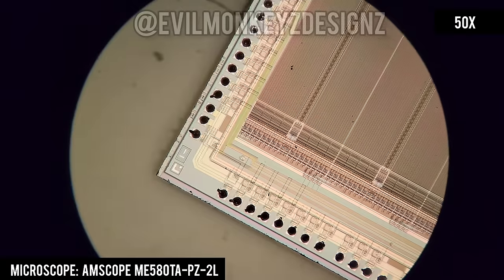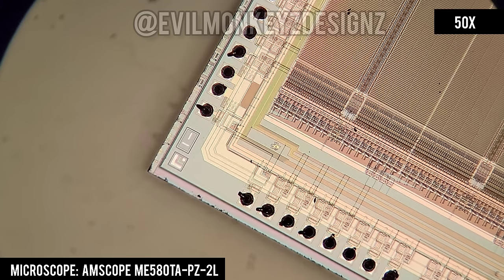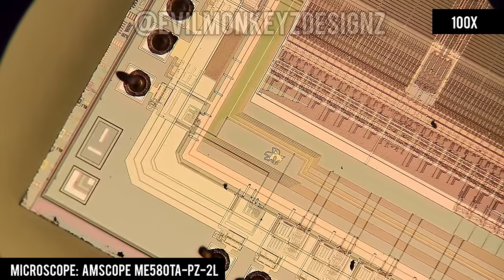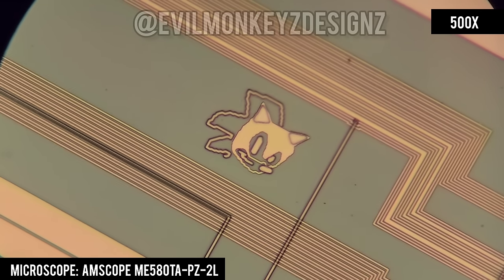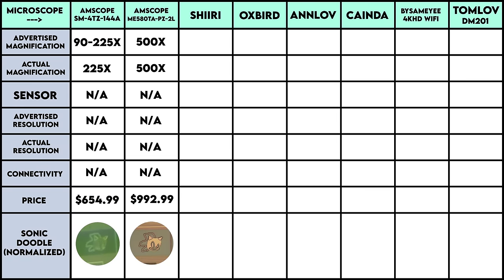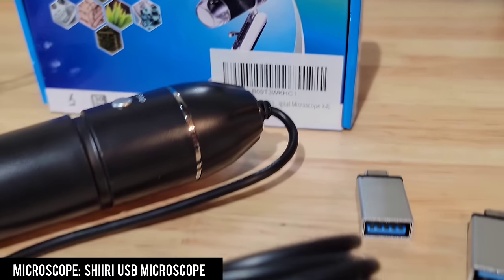Next let's take a look at Sonic. The ADS-P2181 is one of many DSPs from Analog Devices, many of which also have other Sonic-themed doodles on them. It's easy to pick out Sonic at 100 times magnification and even easier at 200 times. At 500 times magnification you can pick out all the details on Sonic and even see that he's on two different layers. At 1000 times magnification and beyond I'd expect Sonic to take up the entire screen. The price listed for the ME580 does not reflect the normal 15 to 20% off sale price that Amscope has on their website.